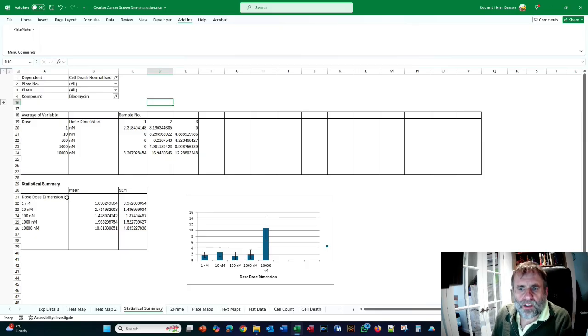So what do we want to do in the initial steps? Well, first of all, we want to graph every single drug. Remember, the aim is to create a single dose response curve for every single drug. But I've also told you that we want the DMSO 0 dose present.